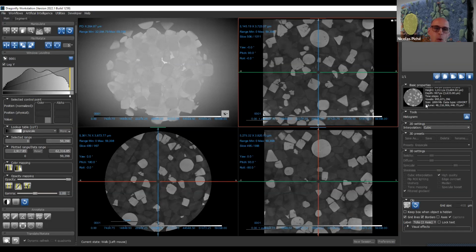Okay. But this data is not calibrated. Sometimes you want to calibrate to say that it's a physical unit, and you know that a tone of gray means, I don't know, an atomic number, or density, or whatever. You can apply a linear transform to your data. So when you click on screen, you know that, well, this is acidity or temperature, or whatever. You can apply a transfer function to give a real physical unit to your data.